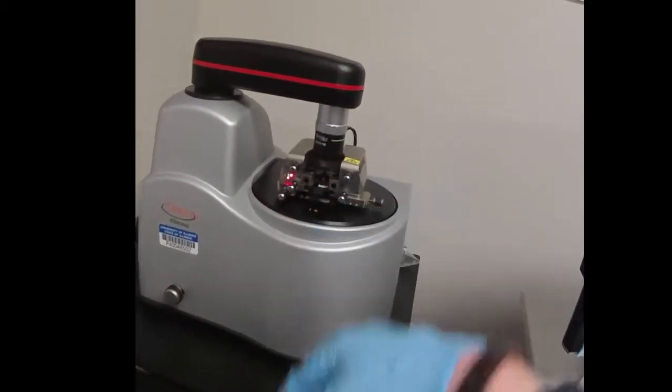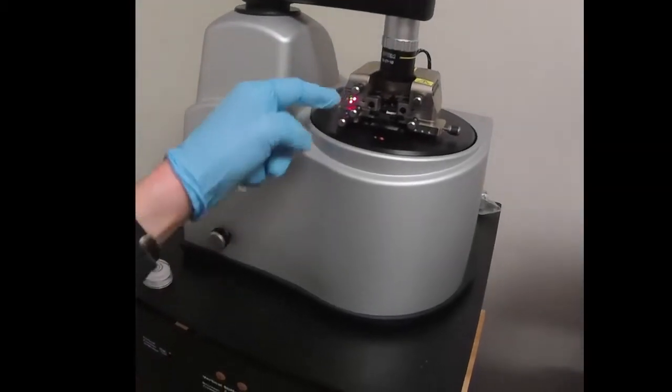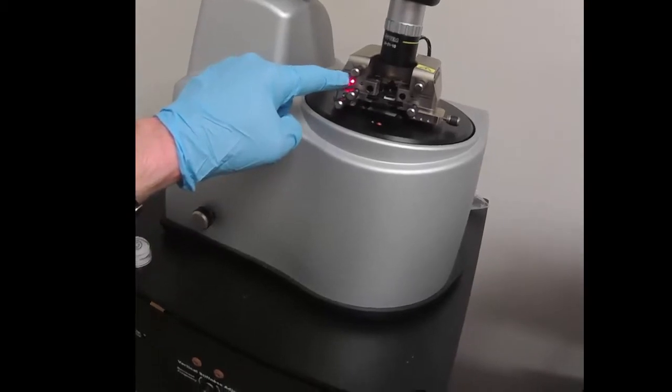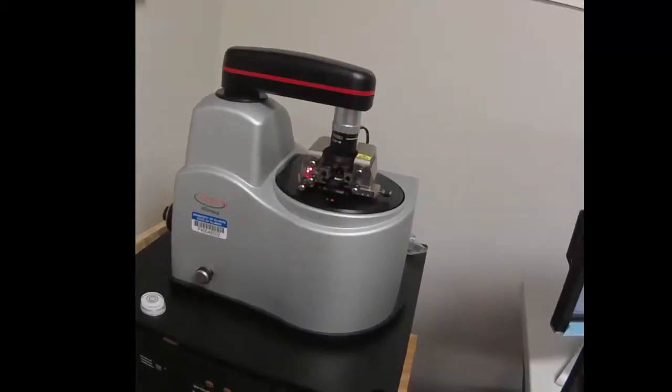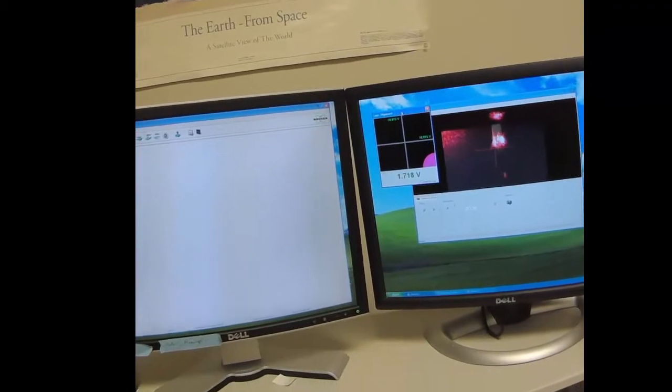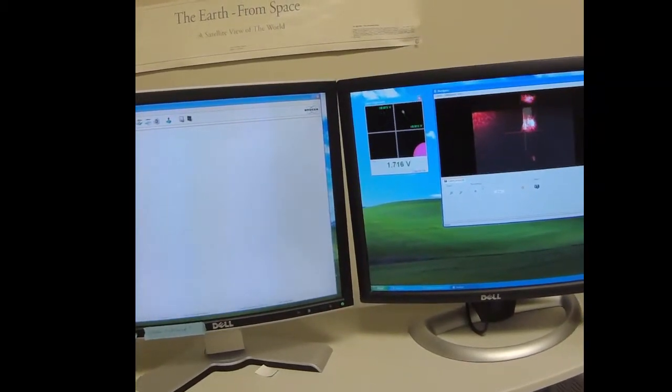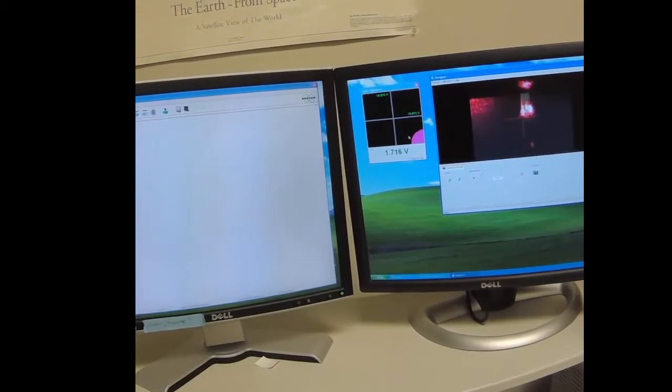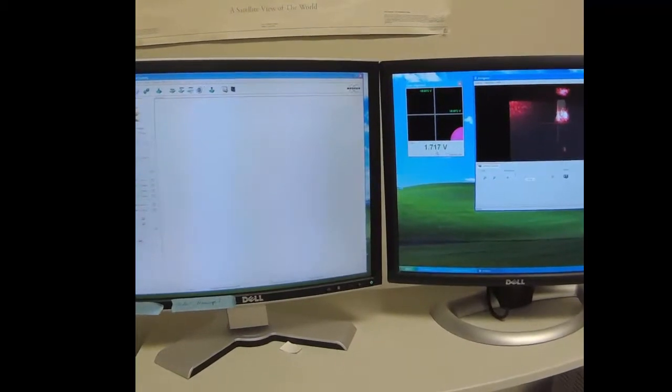So I've aligned the laser spot with the cantilever. Now I need to align the detector so it sees the spot that's reflecting back. These little LEDs tell me that it is hitting the detector. There's a little bit of green, but it's off the bottom and the right. So I'm going to use these two knobs to adjust the detector mirrors. Also to help me, there is a detector display, voltage display, live display. This is a position sensitive detector, four quadrant photodiode. Just like these little LEDs told me, the laser is not hitting the center of the detector. It's off a little bit. This is the total signal that the detector is seeing right now.